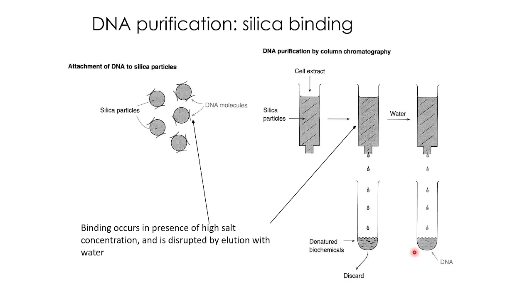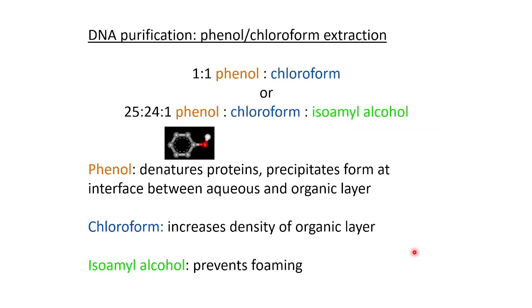Mostly in labs you will see this technique used where you are purifying your plasmids, your PCR products, and the gel extraction products, where you have the DNA and you need to purify it. This is the most commonly used technique you would observe in the laboratories.